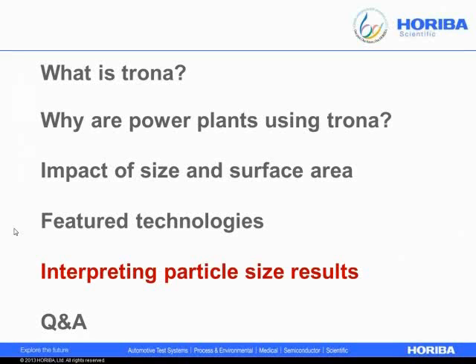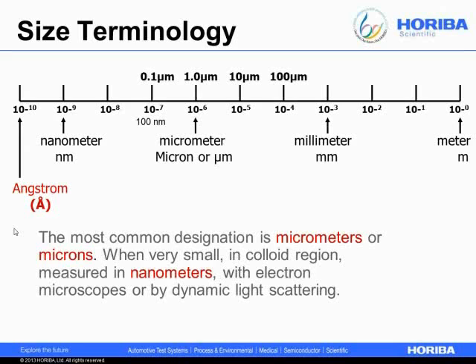Okay, so now I'll spend a few slides. Several of you had requested in the webinar registration some information about interpreting particle size results and also setting good size specifications. So I'll try and meet that need right now. So we'll start off just by making sure we're on the same page with regards to terminology.